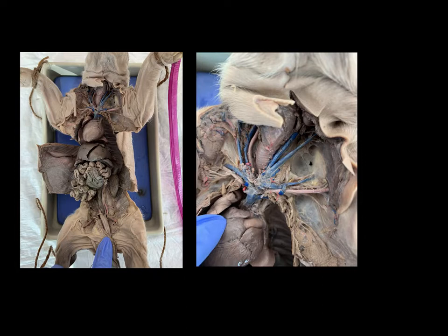So the first thing that we're going to look at are the veins in the upper chest and neck area. We're looking at this area right here in this image. This is kind of the bottom of the pig's jaw. This is the neck area. And you can see right here, we're touching the heart. This is the heart, which is this structure right here.